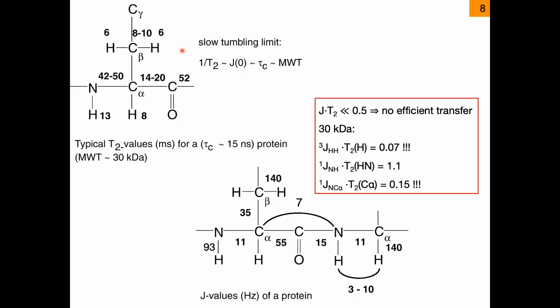It's dipole-dipole coupling to nearby nuclei. And what is the strongest dipole coupling that you can imagine? It's the proton, no? I mean, dipolar coupling is the magnetic moment of one spin times the magnetic moment of the other spin divided by r cubed.